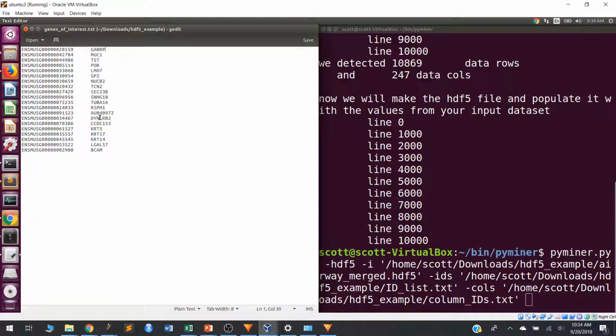And what you can also do is just make this up in Excel, open up a text file, and then copy and paste it into the text file, and it automatically defaults to using a tab delimited format. But if you're doing that, be careful, because sometimes the Excel will also copy in a new line at the bottom, and just make sure to remember to delete that so that you don't have an empty column at the bottom.